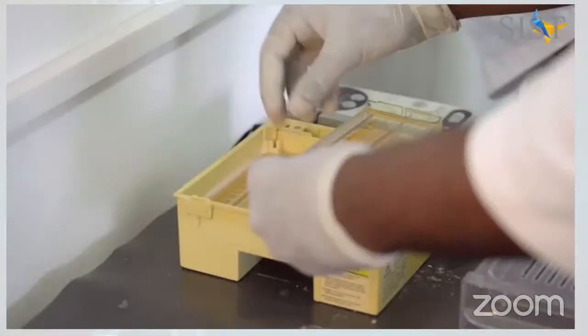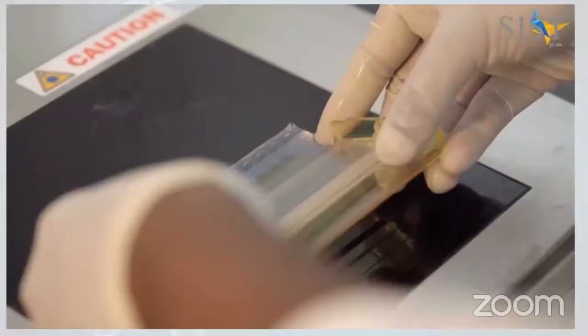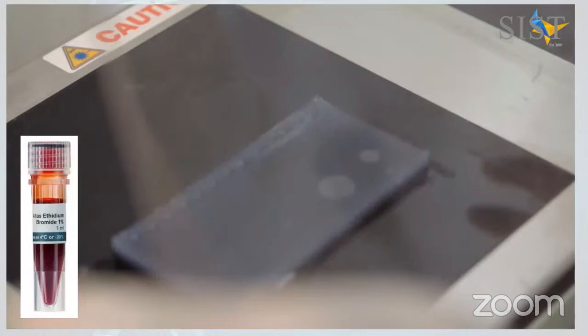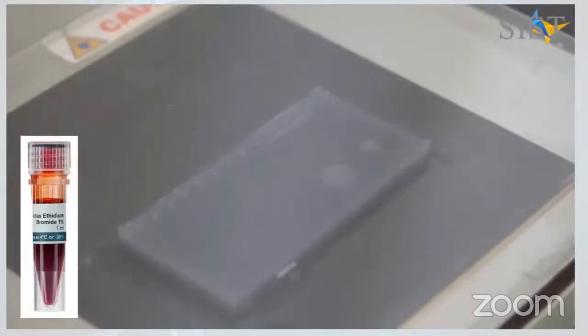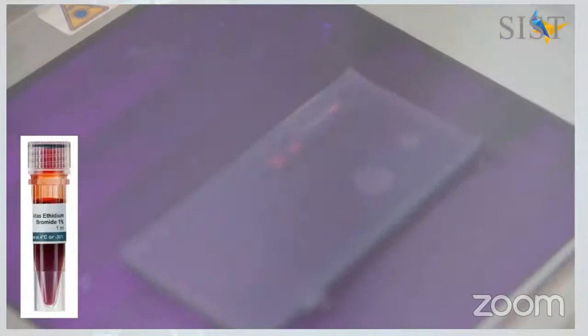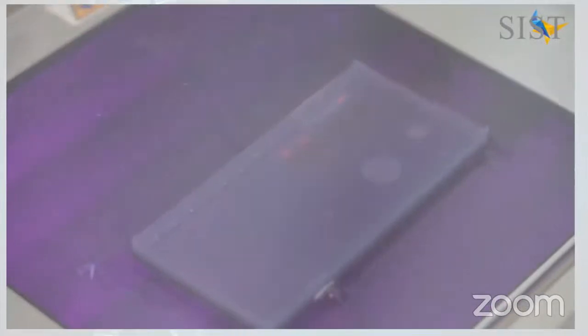Once the gel run is completed, you will transfer the gel onto the UV transilluminator for observation. Here, the DNA visualizing agent, which is ethidium bromide, is used. Ethidium bromide staining can be done in two ways, either as pre-staining or post-staining. In this video, ethidium bromide was added during the preparation of the gel, which is the pre-staining technique. During post-staining, ethidium bromide will be added after the gel run. Ethidium bromide is an intercalating agent that intercalates between DNA and illuminates under UV. So here you see your DNA bands being illuminated under the UV transilluminator.